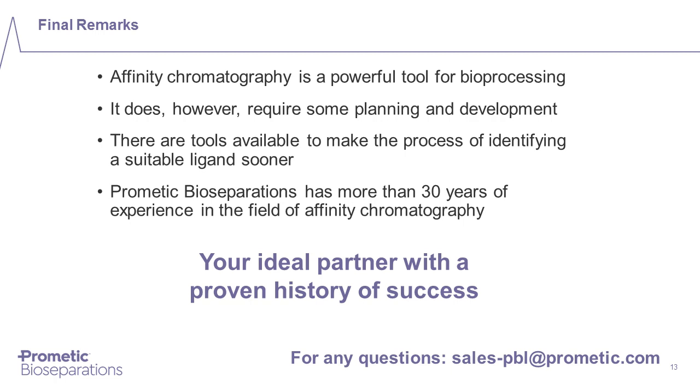So I hope that in this very short presentation I gave you a general idea of what happens when we are developing an adsorbent for affinity chromatography. And just as a take-home message, I want you to remember that affinity chromatography is a powerful tool for bioprocessing. It has a history of success in this field.